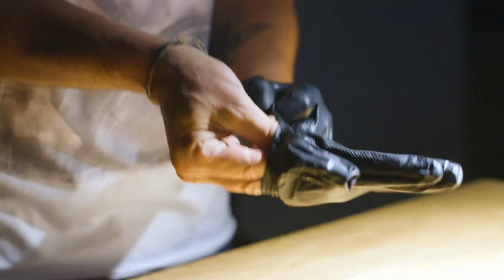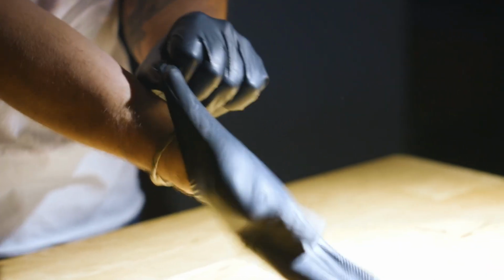And then this part is completely optional, but you can use gloves. Personally, I don't like using gloves because I think it increases the odds of cross-contamination, and also it does not allow me to feel the plant.